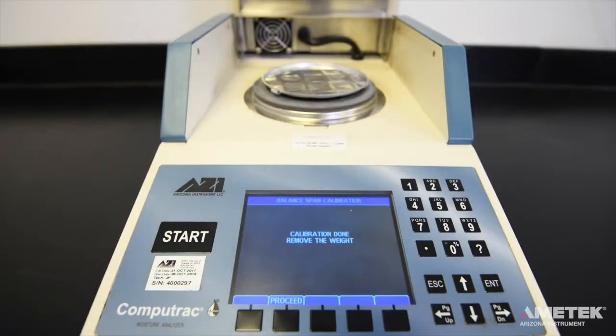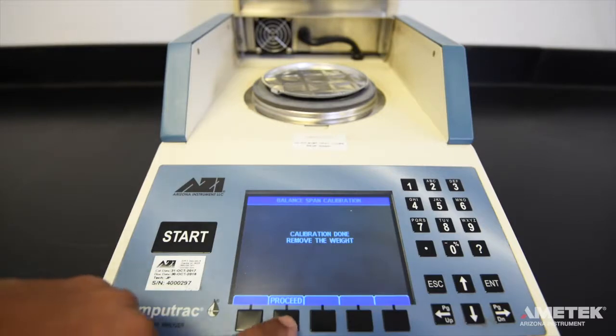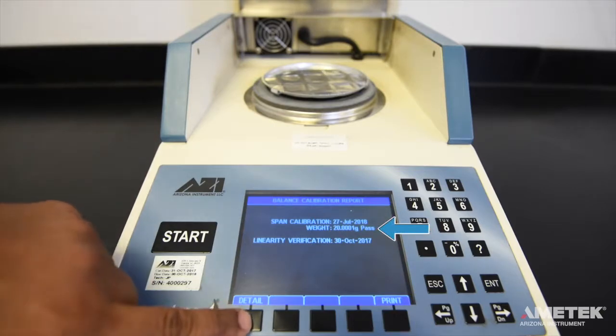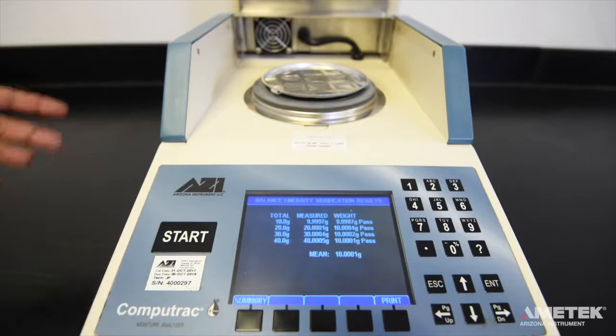At the end of the calibration process, you will see a screen with the button labeled Proceed. Press the button and you will be taken to the results screen where you will find out if the span calibration has passed or failed. After a successful calibration, the calibration report will be displayed.